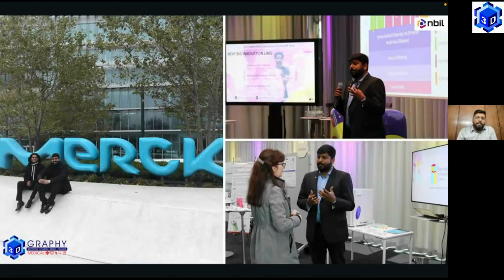for a plethora of applications. And obviously, we had a lot of interactions with scientists who are working on crucial projects within Merck, such as novel drug discovery as well as vaccine development. And that's when we thought of looking at how we could go further and work with one of the teams very closely. One of the teams there working on bioprinting had given us a very interesting project.